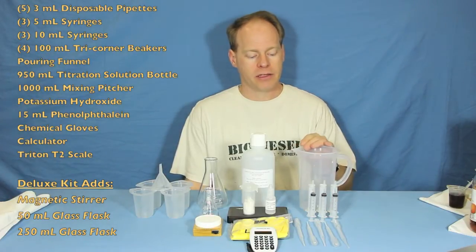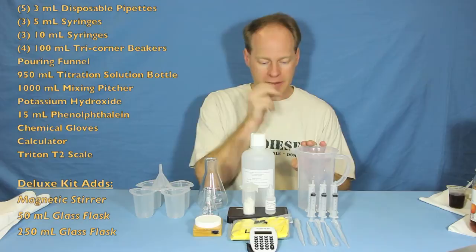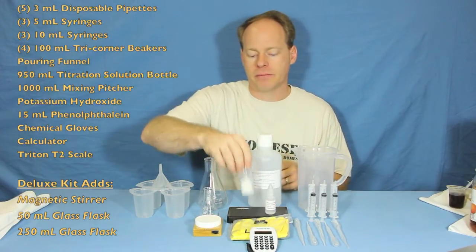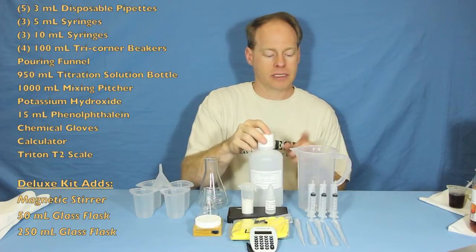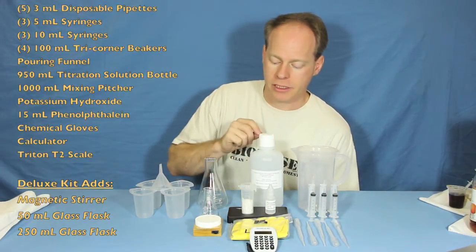We've got a thousand milliliter pitcher to measure out your catalyst and to make your potassium hydroxide solution. We have some potassium hydroxide ready for you to use, and we have a bottle to put that potassium hydroxide in as well, to make your titration solution.